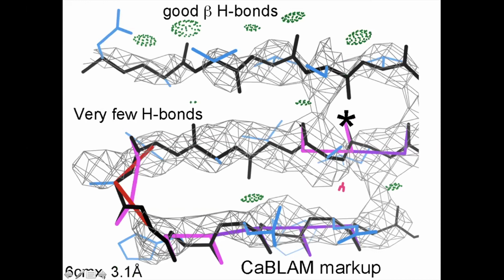And indeed, in beta structure, there is a systematic error where people sometimes fit 3 adjacent carbonyls pointing in the same direction, or approximately the same, and that's always wrong. 2 in a row you can get, and that's a common way of making sort of a corner in beta structure, but 3 in a row is almost certain to be wrong. And if you flip the central ones, including the inner ones here, then the tight turn looks reasonable enough that you can fix it.